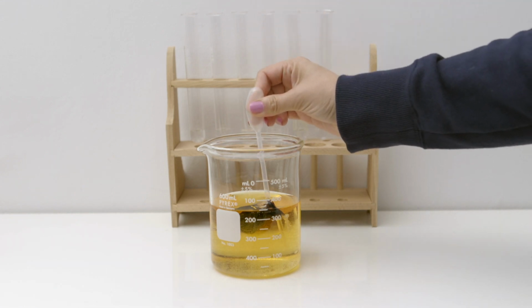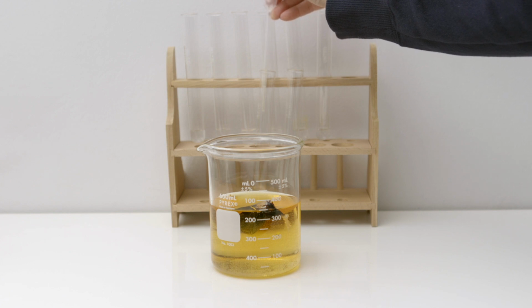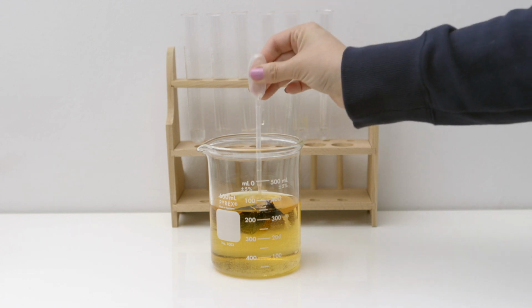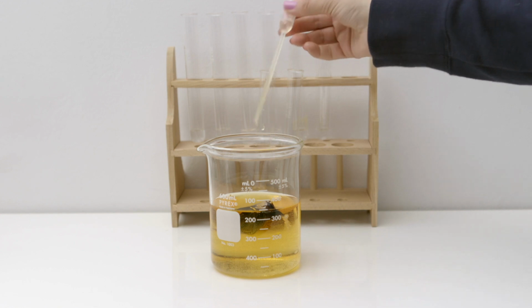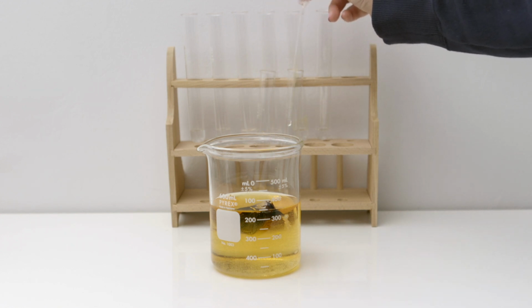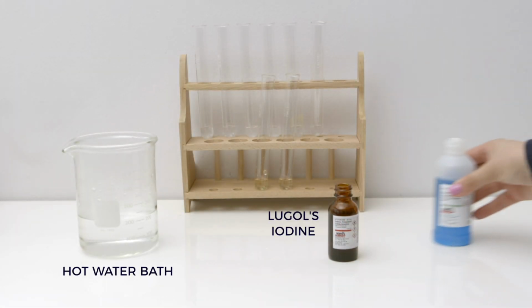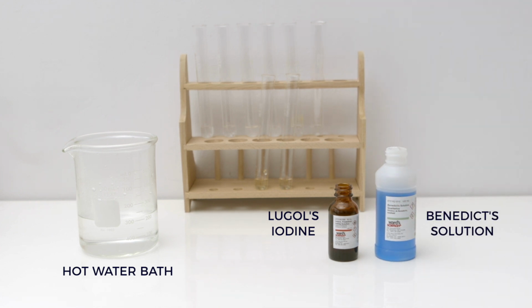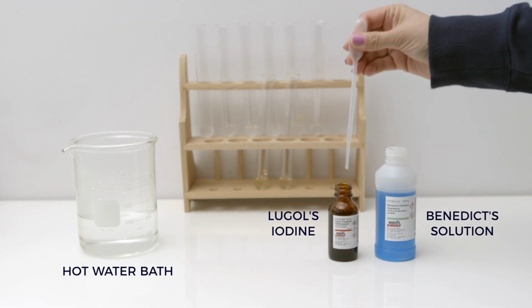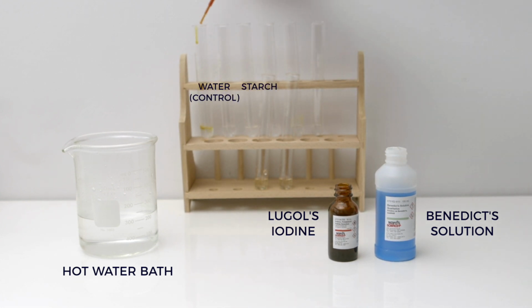Use a pipette to transfer some of the water from the beaker into the two empty test tubes. We are going to perform some tests using our indicator solutions to see the results. In our test tube rack, there are a total of 8 test tubes. The first 2 contain water, the next 2 contain starch, the next 2 contain glucose, and the 2 on the bottom contain the solution from our beaker.